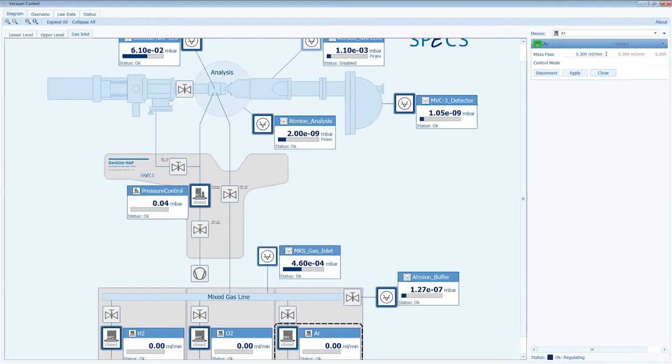And if you open this pressure controller, you have to put a higher flow on the flow controller to feed the cell. But in this case, most of the products or gases coming in the nozzle and analyzed by the QMS are actually coming from the vicinity of your sample.